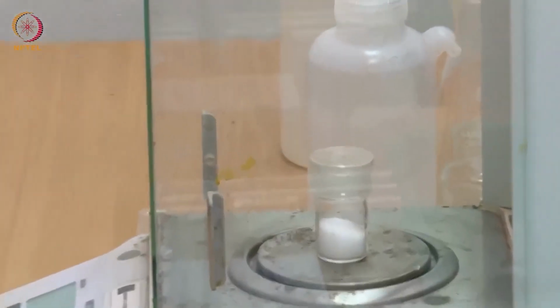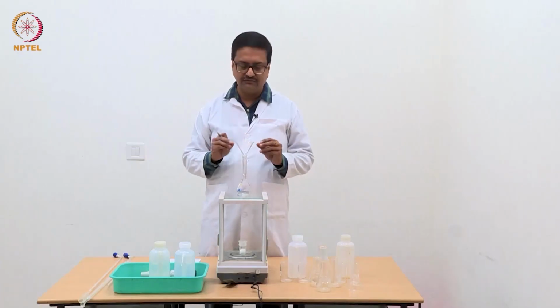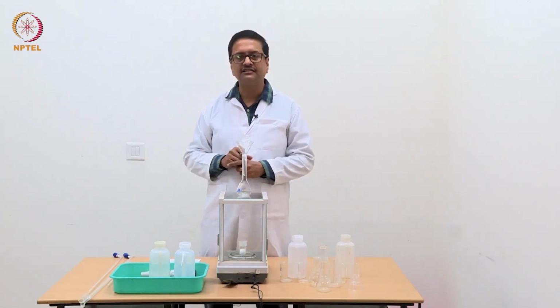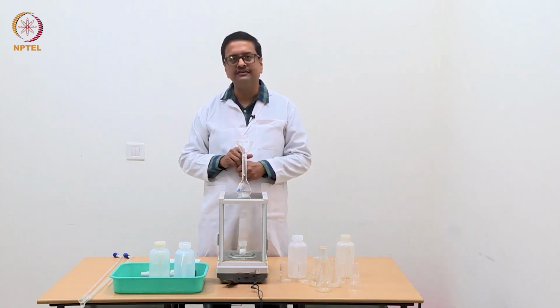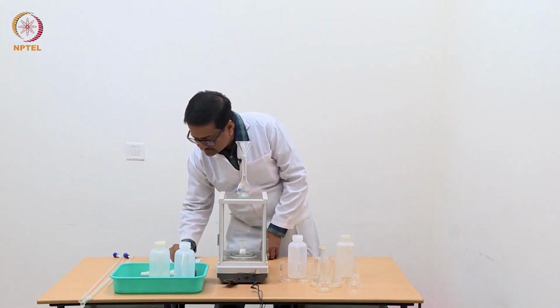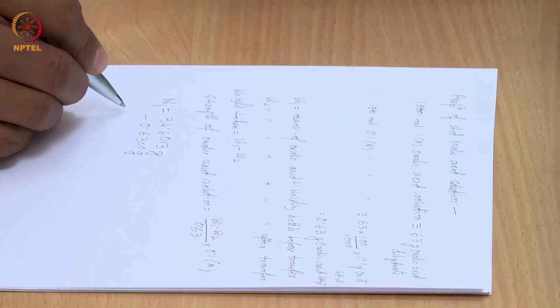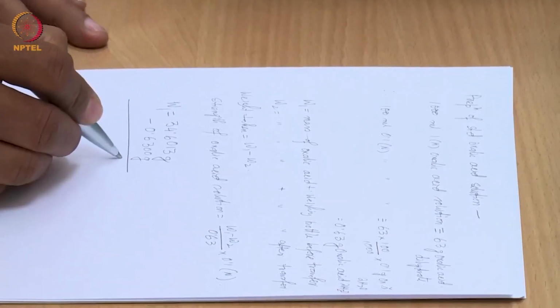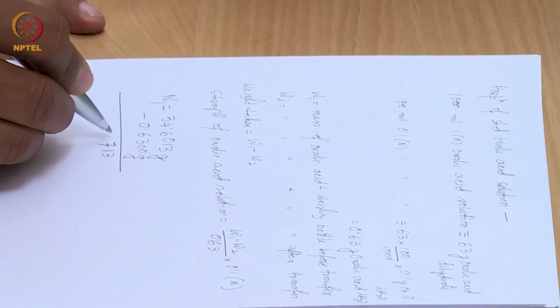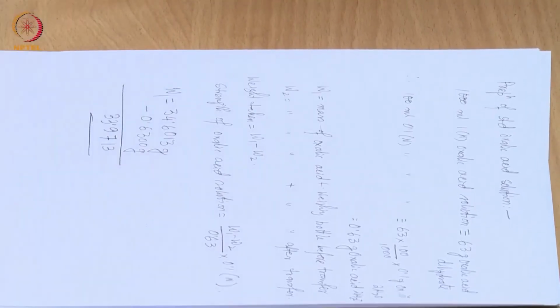Every time when you do an experiment, you should have a notebook to write down what you observe. Now what we need is to transfer exactly, or approximately as close as possible, to 0.63 gram of oxalic acid from this bottle. So we quickly do a subtraction of 0.6300 gram and we arrive at a number of 33.9713 gram.